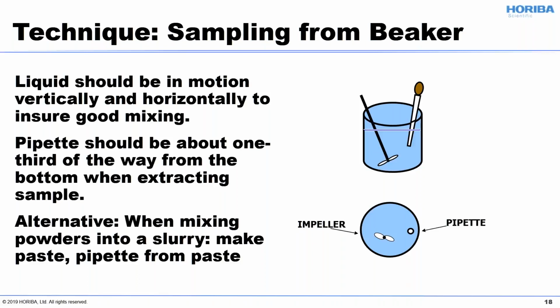And remember, just because you mixed it before lunch doesn't mean it stayed mixed after lunch, because the larger particles will tend to settle. If you really wait a long time, you can even see some nanoparticles, like nanogold, will separate if you give it many, many months in the lab. And that goes right back into suspension. So just mix right before you sample.